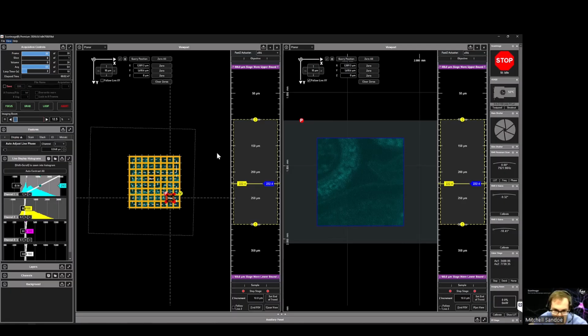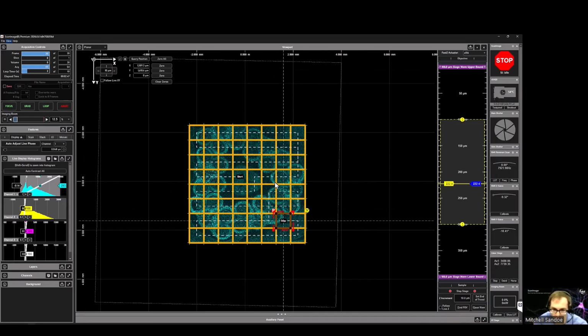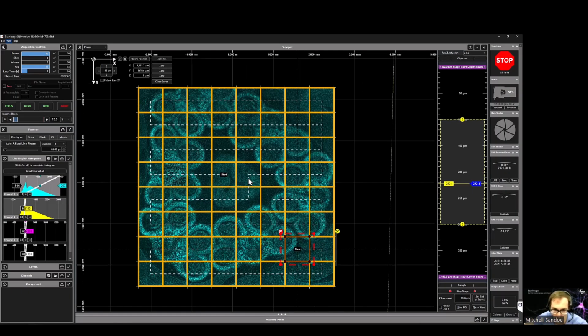And now that we have our beautiful mosaic, we can get rid of the second viewport and zoom in on the pinned background of images. We can hide just the mosaic outlines from the Layers GUI for a cleaner view of the mosaic.